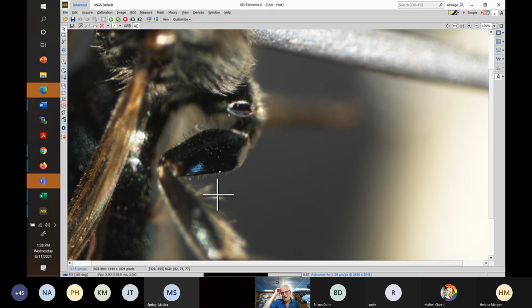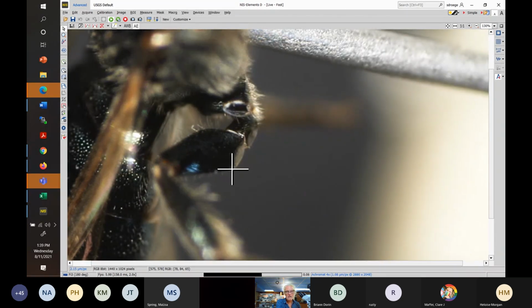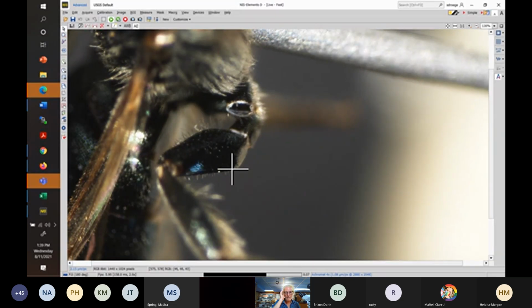So the presence of hairs there means dupla, the lack of hairs, micmaci. There are also ridges here in micmaci, which are not very ridgy, less sharp. But I find most people have an incredibly difficult time seeing that, and sometimes this leg is in a bad position to see anyway. But the tuft of hairs is almost always going to help you out.